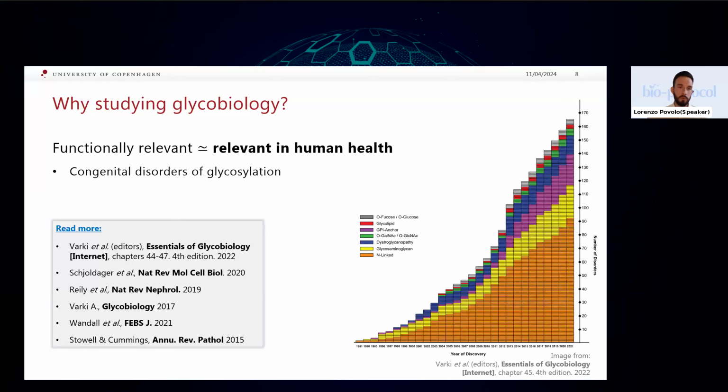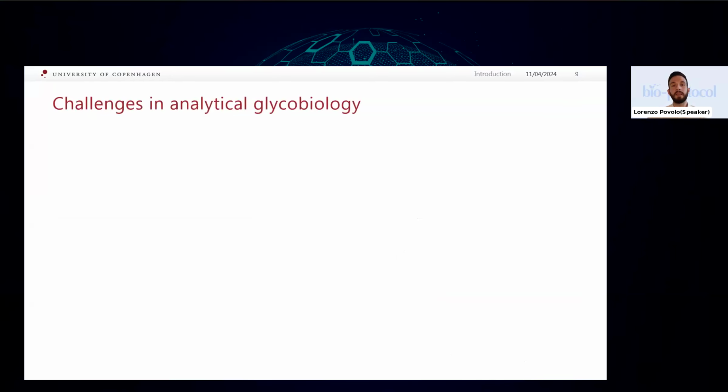Throughout the presentation, you will see these gray boxes that, for example, report some references and some key take-home messages that you might find important, and that you can come back to by looking at the recordings. So, as you can see, glycobiology is relevant, but studying glycobiology also comes with several challenges, especially in the analytics. The challenges are mainly due to the complexity of this type of post-translational modification.